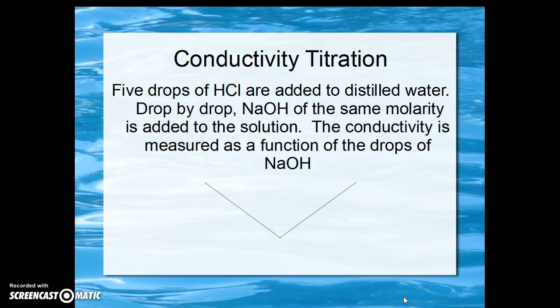Let's talk about conductivity titrations. We're going to add hydrochloric acid drop-by-drop to distilled water and measure the conductivity. We're going to then titrate the hydrochloric acid by adding drop-by-drop sodium hydroxide of the same molarity to the solution.